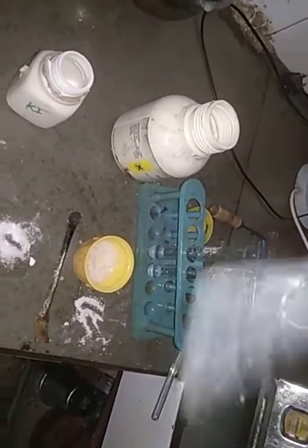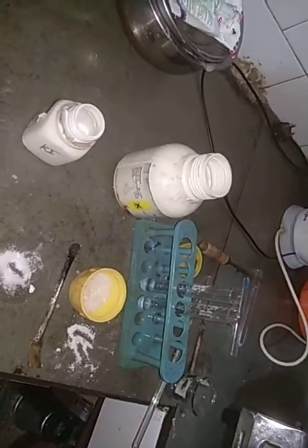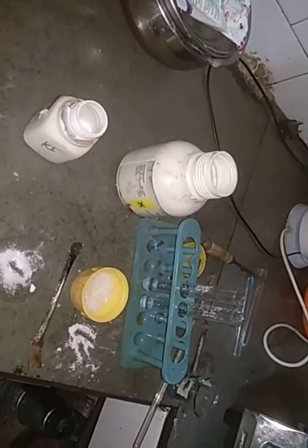You can see that the crystals have not been dissolved and they are lying at the bottom without any kind of change.